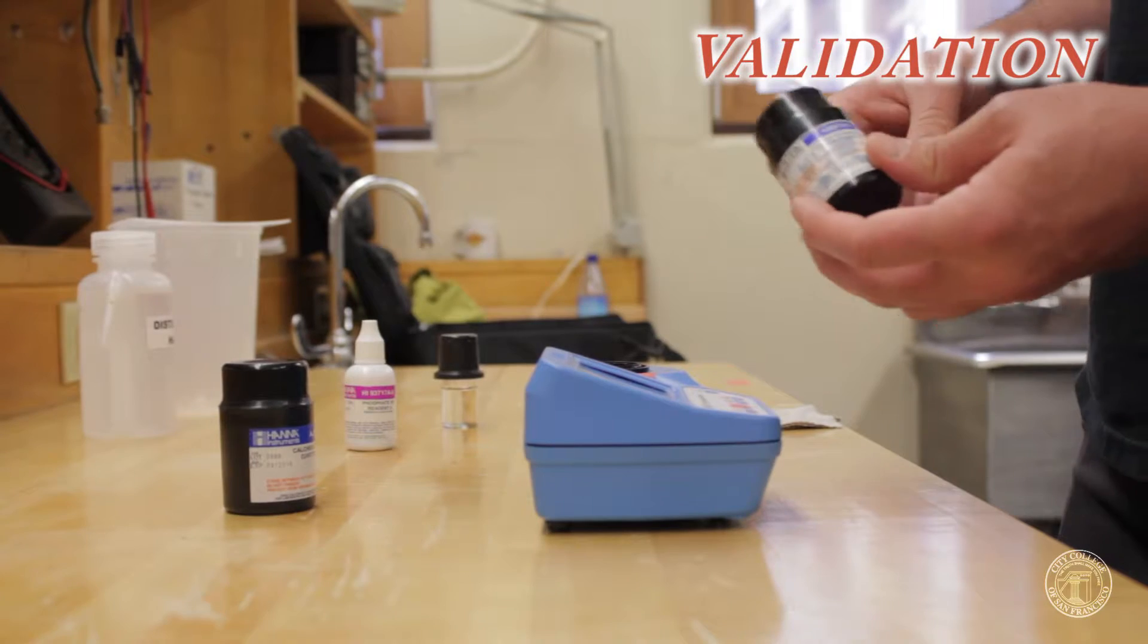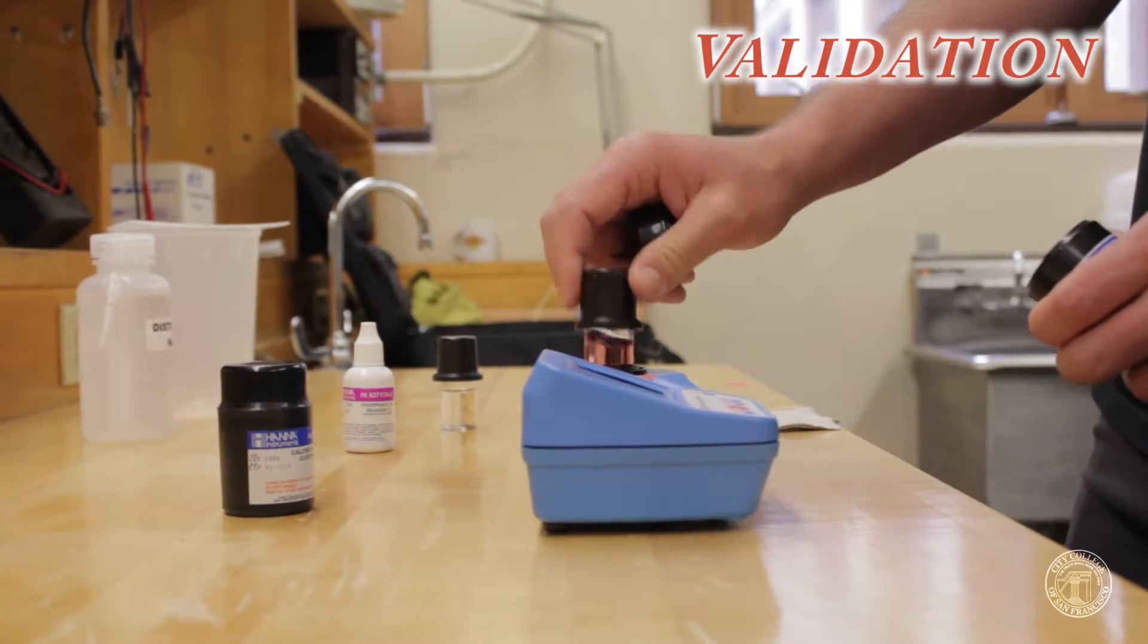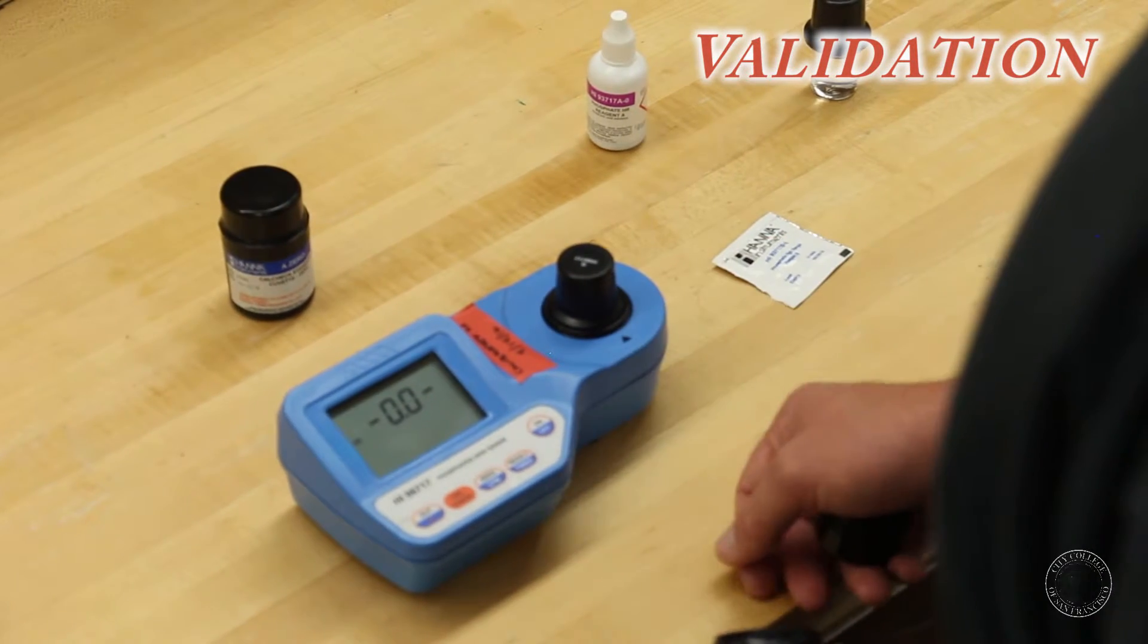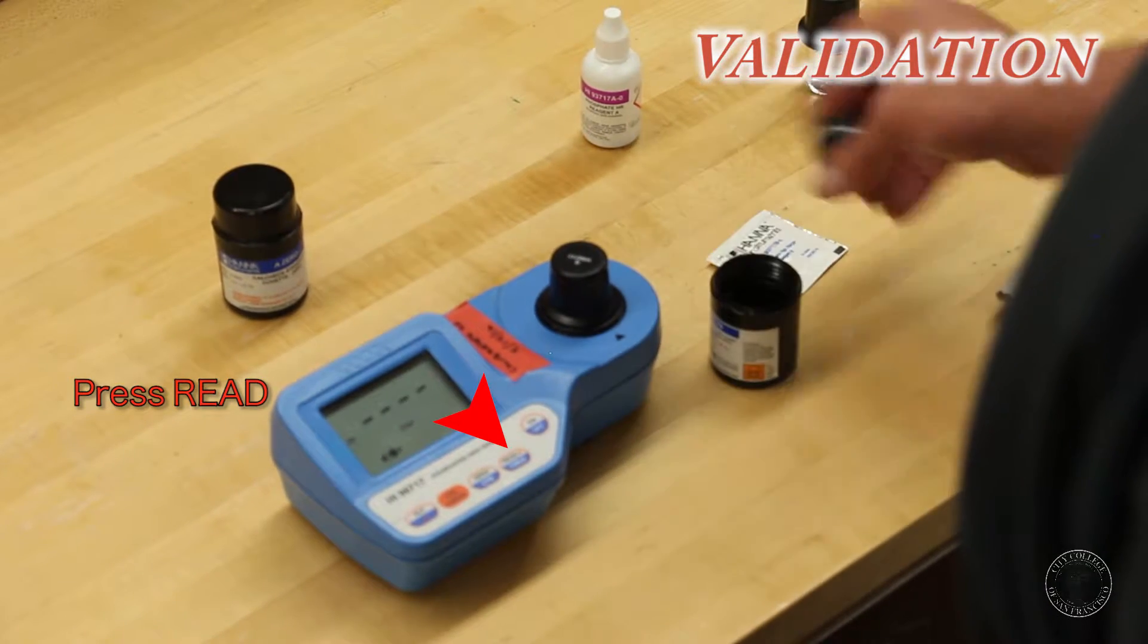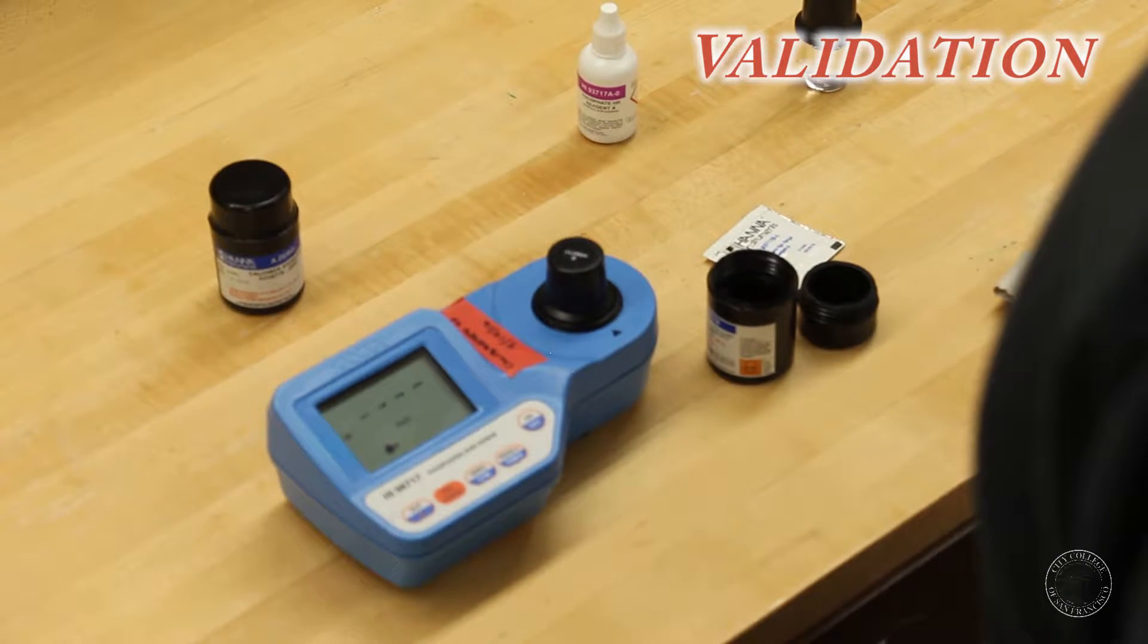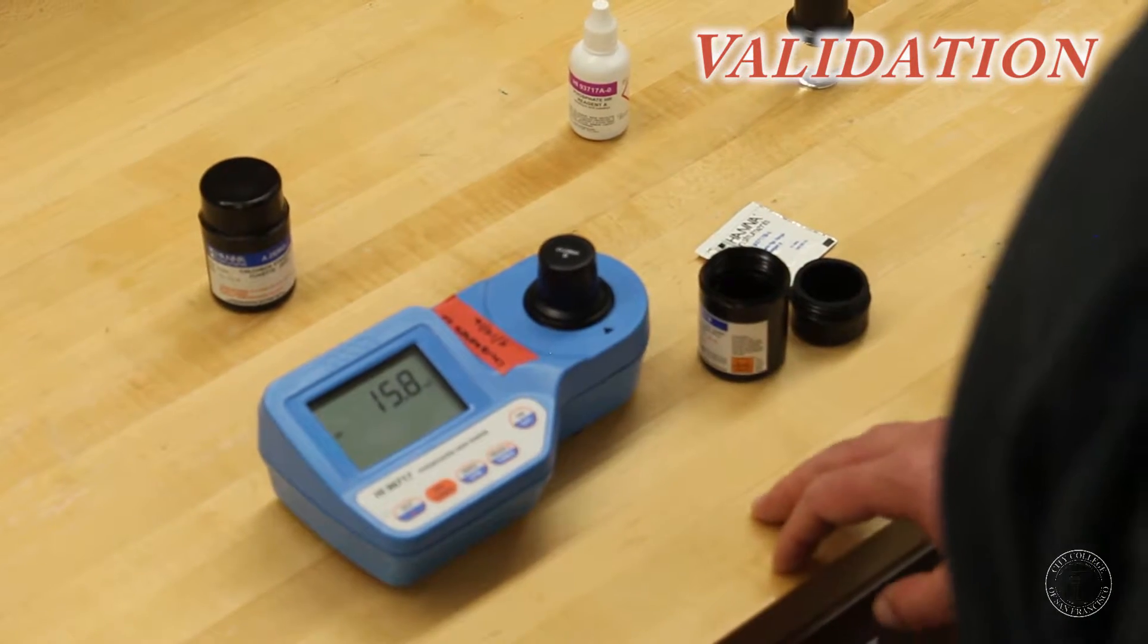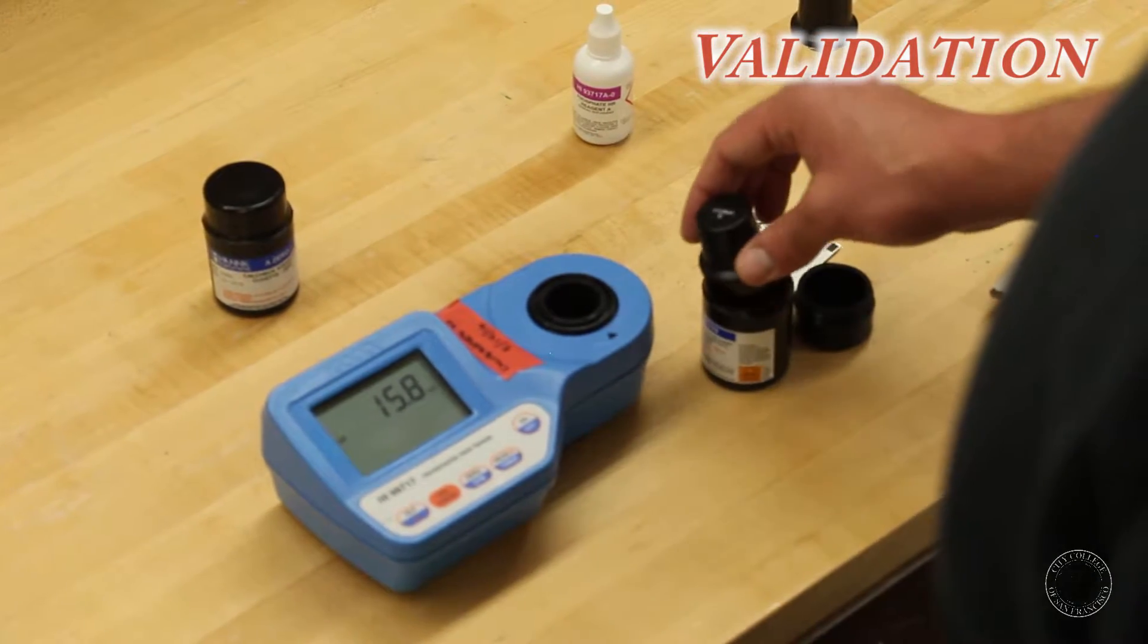Now the lamp is set and the machine reads this as a zero solution. Then using your 15 milligrams per liter standard, you will check to validate that the calibration is correct. Then insert that, make it click, and hit read. And here it's reading at 15.8 milligrams per liter. This variance could be due to the temperature change and the different temperature of the standard.